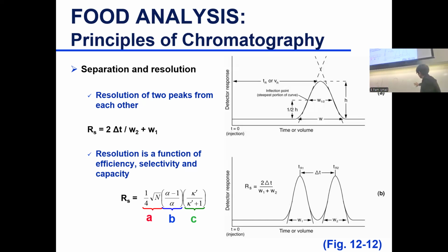Okay, so that explains this phenomenon. You have good separation, and for some reason, we'll talk about the reasons, we don't reach equilibrium quickly, the sample diffuses, then it takes longer to come out, then the two peaks that used to be resolved co-elute or no longer resolve. So the width is wider and hence the inverse relationship. Okay. Good so far? All right.